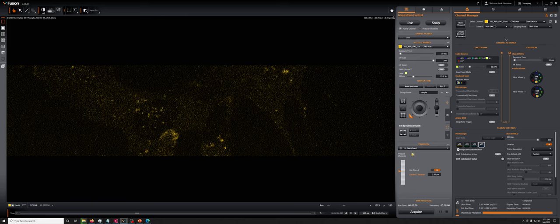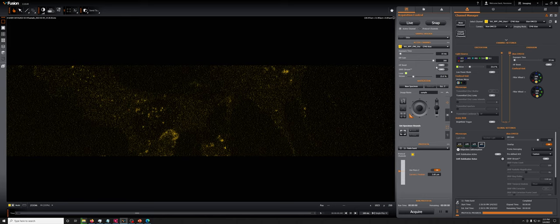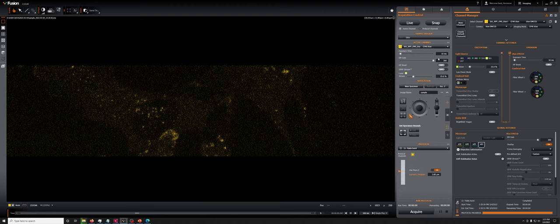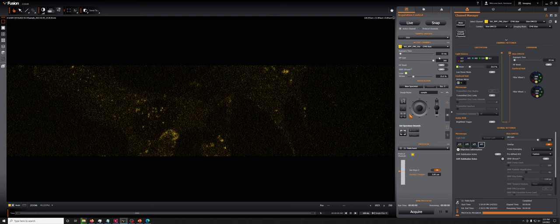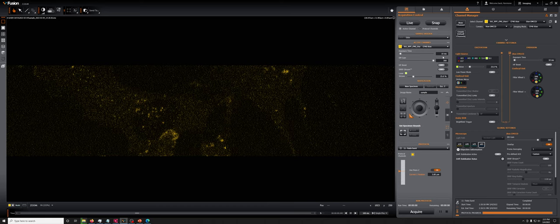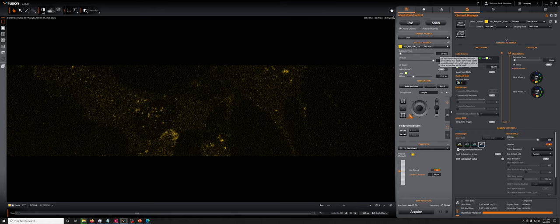So a final note that's important. Because of the speed of the spinning disc, you want this number, your exposure to be a multiple of 2.5. 2.5 is really the minimum exposure you should use. And it's very hard to actually get down that low with something bright enough that you can actually image it. But if you have to, there is that option. You need to make sure your exposure time is a multiple of 2.5. And the typical lowest exposure time that you can use is 10 milliseconds. Below that, while it's technically possible to use 2.5 and 5, you tend to have a lot of artifacts.